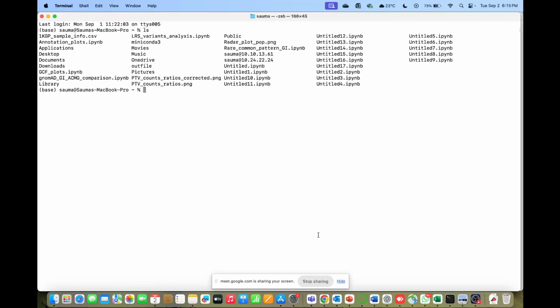I have an account on a system in my department, so I connect my computer to that system and use it to access all the files and run code, different pipelines, and so on, right? So, firstly, I would like to show you how it connects.